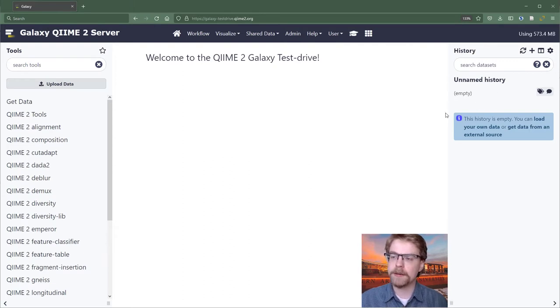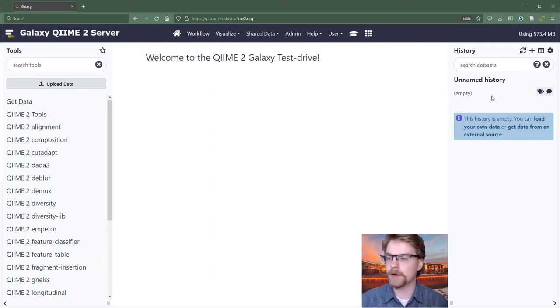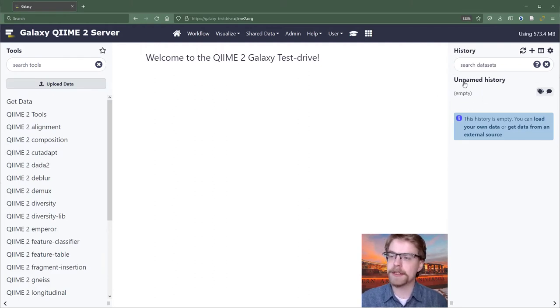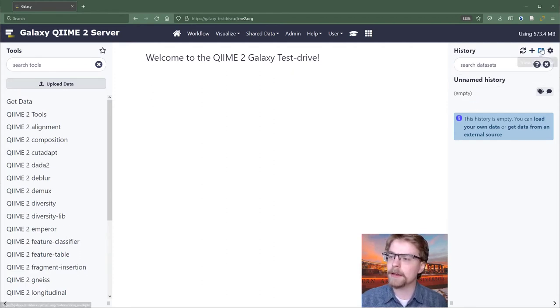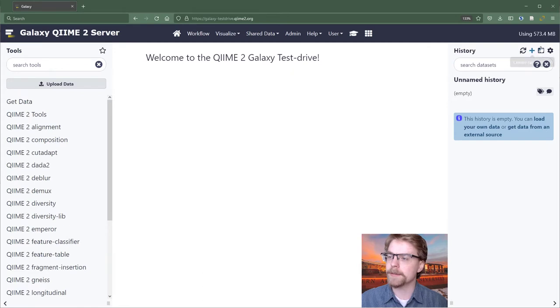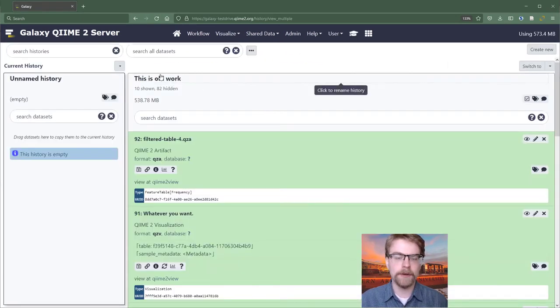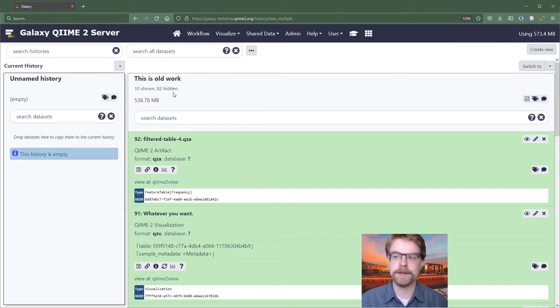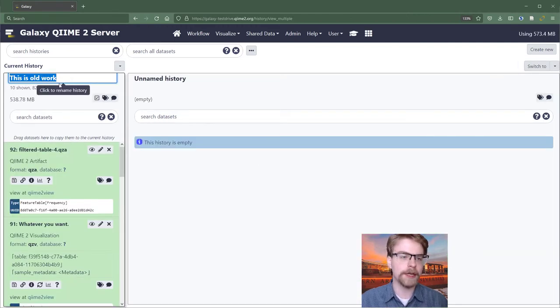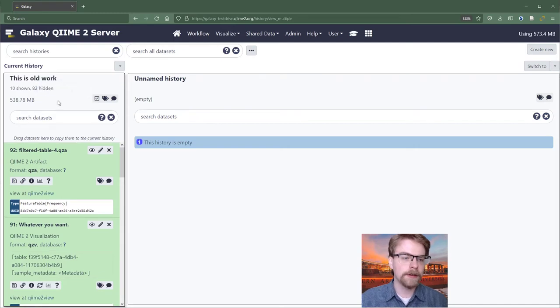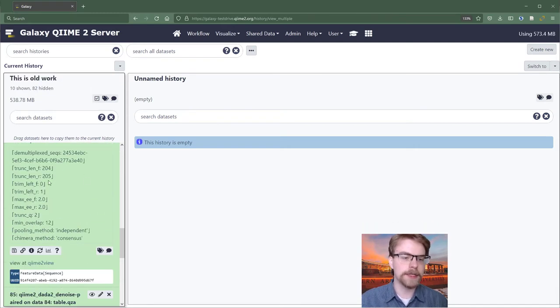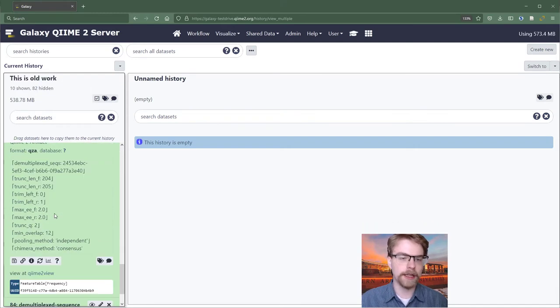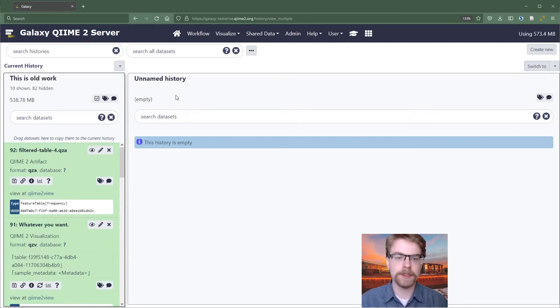As we perform work, we're going to be adding files to this history and generating files which will show up in the history. I have an example of a history I've already worked with, and so I can show you that by managing my histories up here. I'm going to view all histories. And we can see I have a history called This is Old Work. I could switch to it. I could rename it. I can use any of these elements.